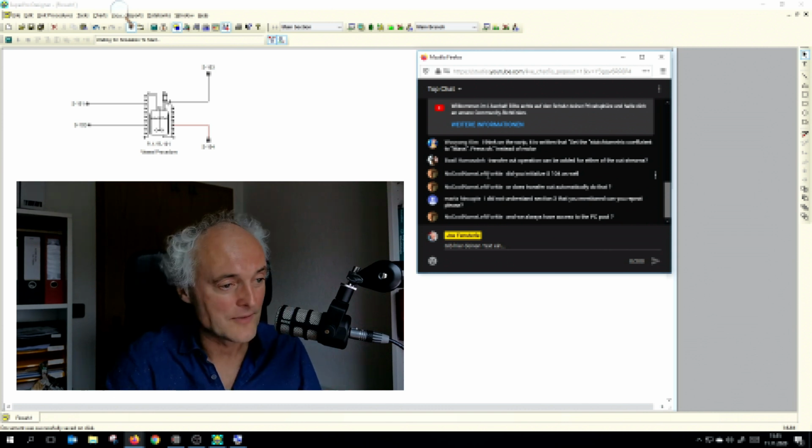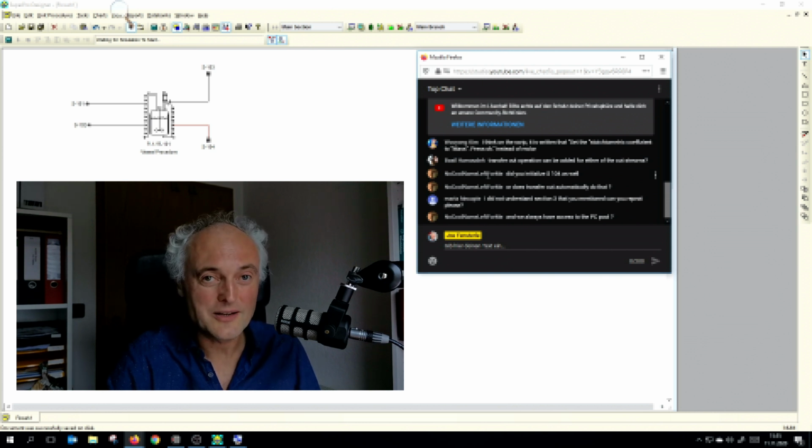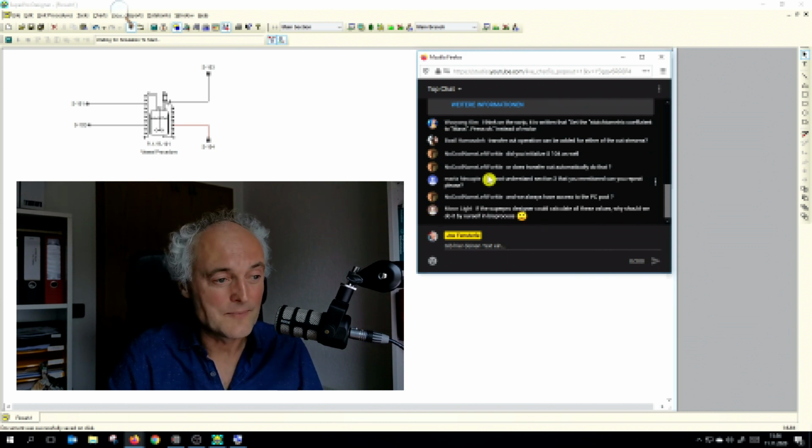within the stream. I don't understand section 3, what you mentioned. Can you repeat it a second? And we always have access to the PC pool. Yes. So this is the cool thing about that. Virtual access to the PC pool, you always have.